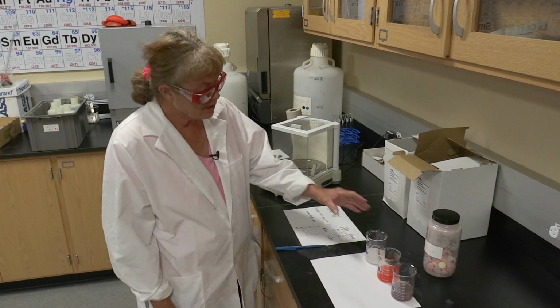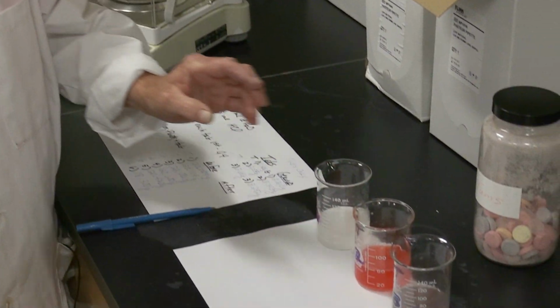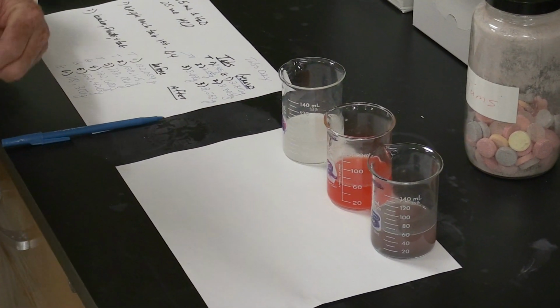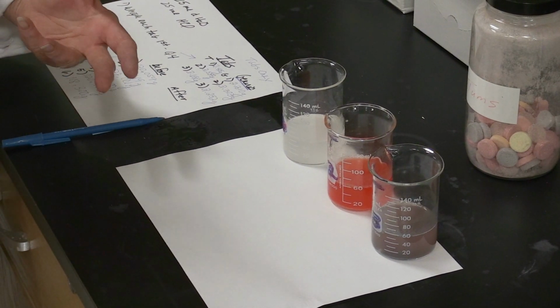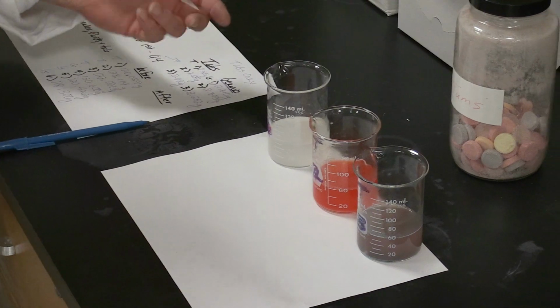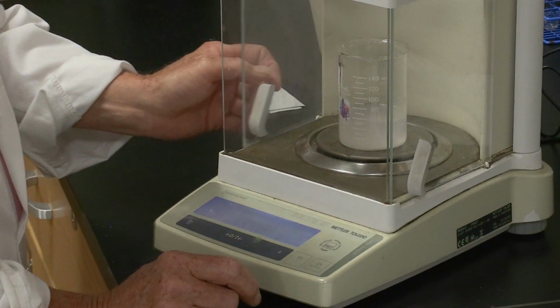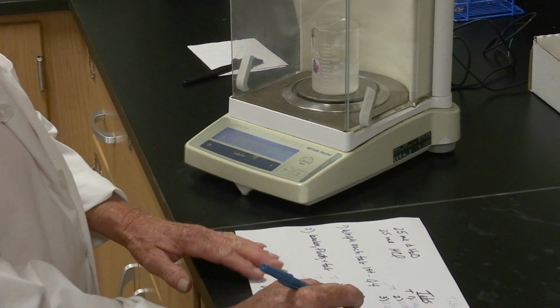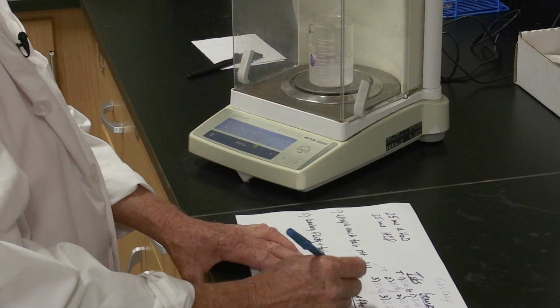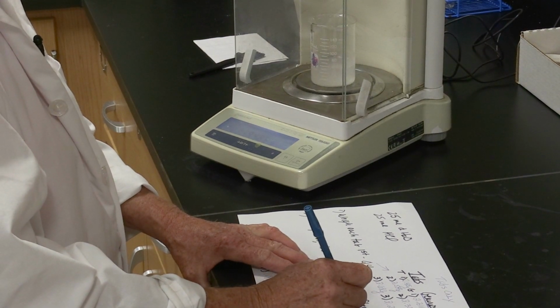All right, well, it looks like all of our tablets dissolved and the CO2 gas is gone. So we're going to reweigh each flask and we'll get the mass of the CO2 by difference. All right, let's go. Tums 1 is 119.485 grams.